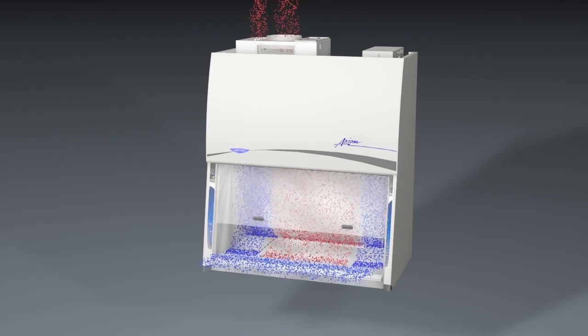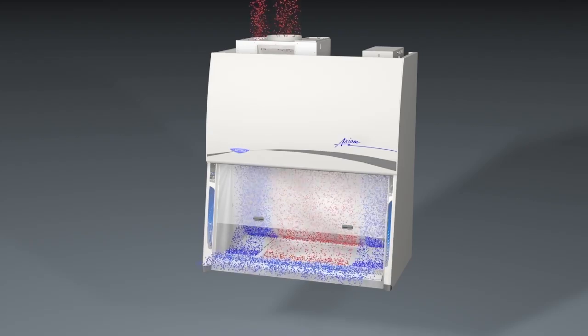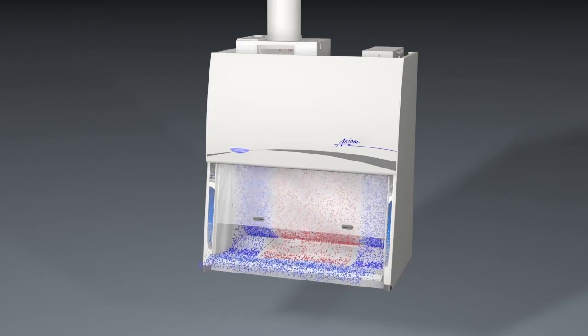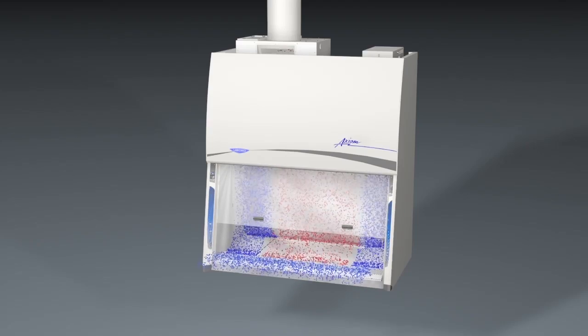OmniFlex, the Axiom's ability to change between the recirculating Type A mode and the ducted Type B mode, provides unparalleled flexibility for tomorrow's laboratory.